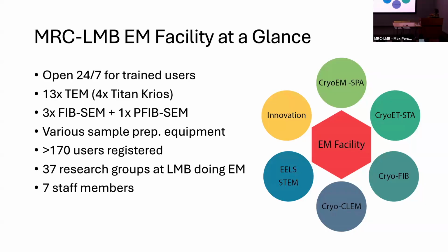Now our facility is one of the many facilities at the LMB. People use it 24/7, because our booking is on all the time, so anytime you come here, the microscope is collecting data. We have 13 transmission electron microscopes, including 4 Titans, which are for very high resolution data collection.